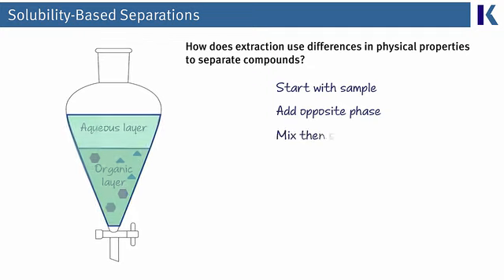That involves mixing of our 2 layers and then allowing them to settle before collecting that aqueous layer. Importantly, the student performs this step 3 times for each of the 3 washes. While this may seem like a minute detail, in practice it's actually extremely important to perform a wash step several times. More washing then allows for greater interaction between the component and the aqueous phase, not only increasing the amount that can be extracted, but also increasing the purity of each component that we then collect.